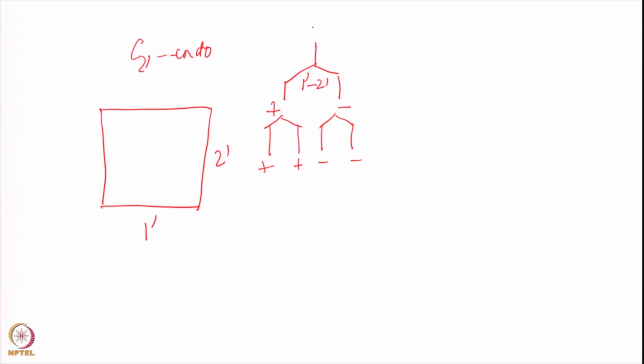Okay. Now this is the H1', now let us look at the H2'. H2' once again, 1', 2' is the active coupling. What are the coupling constants here? In this case I will have 2' to double prime, 2', 1', and 2', 3'. There are 3 couplings, okay, and the 2', 3' is not 0. So let us start with this big one, 2' to double prime, that is the big one there.